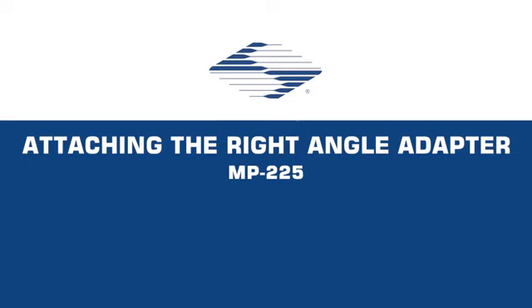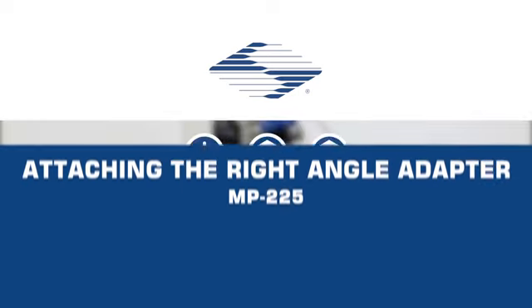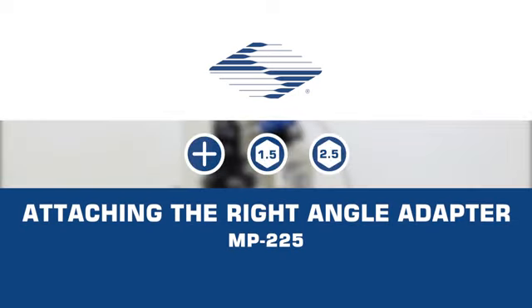This video will cover the right angle adapter installation on the MP-225 micromanipulator. The right angle adapter is an affordable manipulator accessory that helps you overcome space constraints in your experimental setup. You'll need a Phillips head screwdriver, an M1.5 Allen wrench, and an M2.5 Allen wrench.